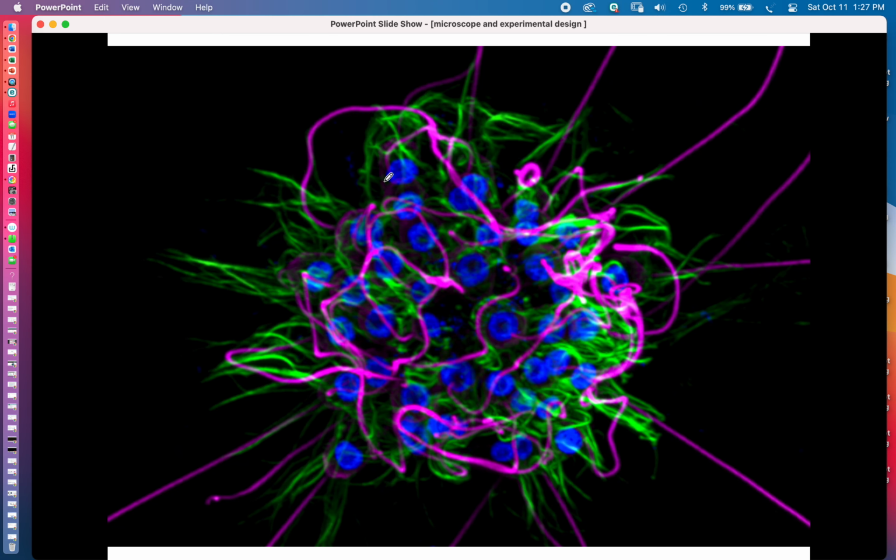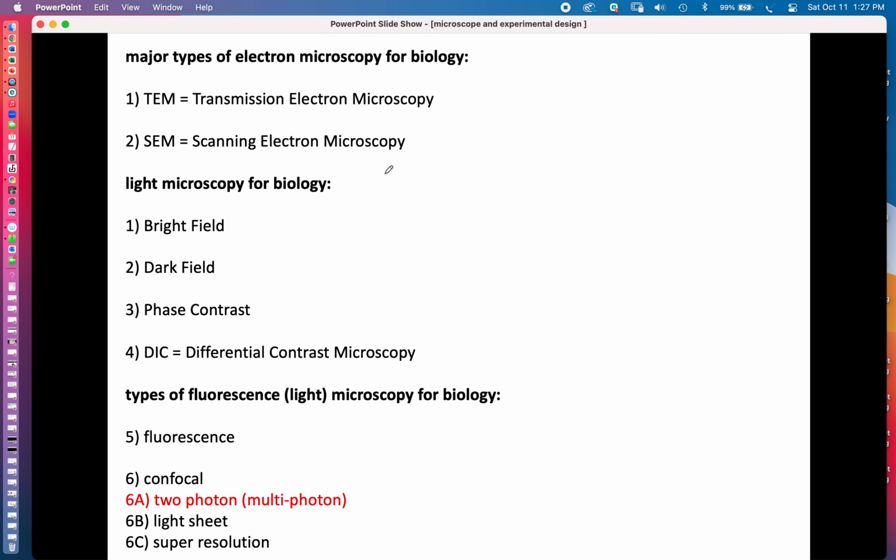Another thing to mention is that light microscopes can do magnification that's very good for biology. They can easily magnify specimens and see the cells in the specimen and the nucleus and some of the organelles. So it's a good level of magnification. We just need to continuously try to increase the quality of the image. So that's a confocal, and the key thing about a confocal is that it's going to remove that out of focus information, give us a high quality image, and it can also stack it.